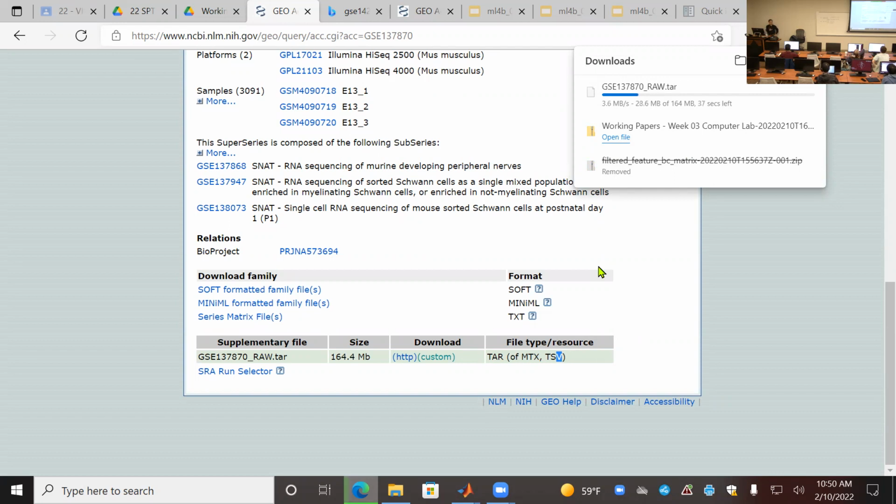So in this case, I will treat this file locally and see, depending on the cell types, whether I can get that in. So you see, in a different scenario, you have to treat the condition differently and find a way to get data in. And sometimes the authors just make mistakes. They didn't give you the gene names, or maybe they have the wrong data format. So in some cases, you just cannot get the data itself. Okay, we have to accept this.